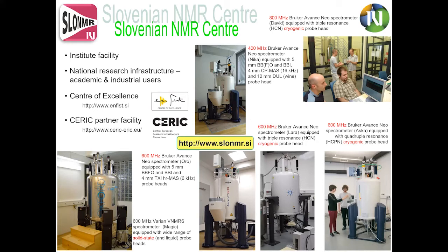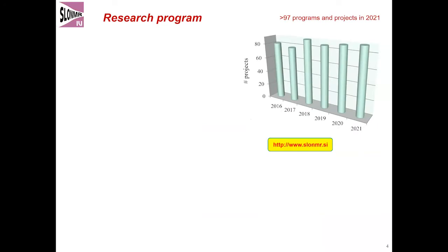I hope so. So we now have 600 megahertz, which is modern, up to date. Of course, it's not top of the standards. We wish to go further, but you can see it in terms of instrumentation. In terms of personnel, proper expertise is there. As indicated by the earlier speaker, you click on the CERIC portal or you click on ours and you'll get contact to get in touch. And my team and myself will certainly be helping to guide you, as we all do.